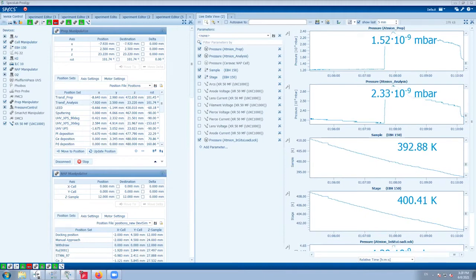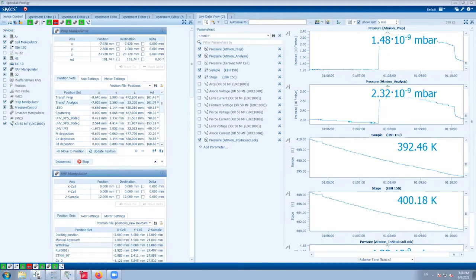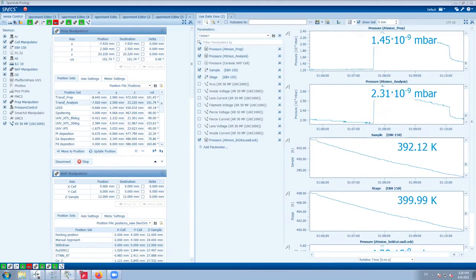But very probably you would like to heat up the powder sample as well. In this case, we use different meshes. We have a stainless steel mesh, and we also have, probably the most used one, a tungsten mesh. You just cut with scissors, vacuum scissors, a little square, let's say 7 × 7 millimeters, or even smaller.